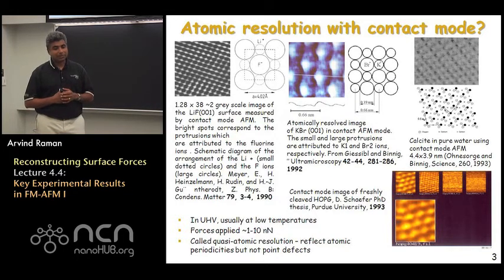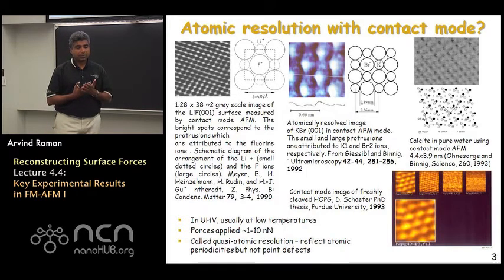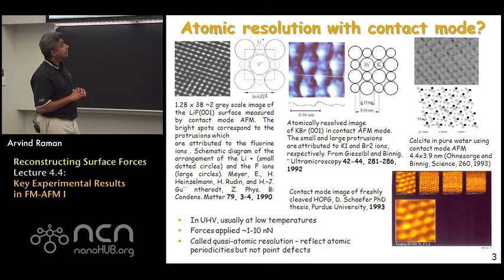The reason one needed ultra-high vacuum is really to make sure that the surfaces were absolutely clean, so that the imaging tip could truly encounter the actual atoms on the surface and actually probe around and feel effectively the actual topography of the surface without polluting or having other things disturb the surface.